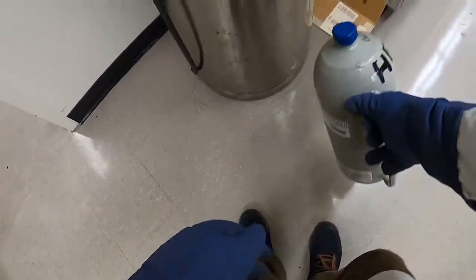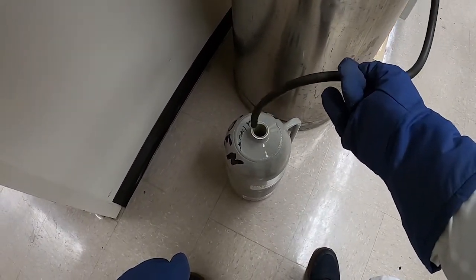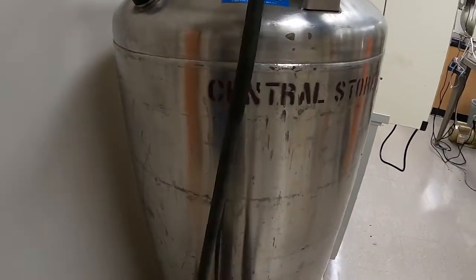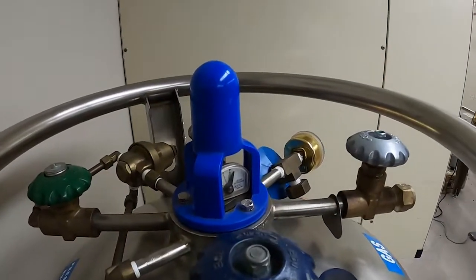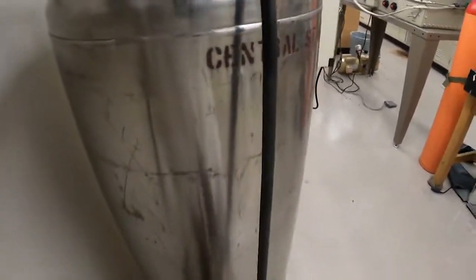Kind of our first step is to take our handheld dewar here, and we'll put our rubber hose in it. Pretty straightforward. Put the little cap, I'll just throw it on the floor. Then, here on the top of the canister, there's this valve for the liquid. We just want to open it slightly.